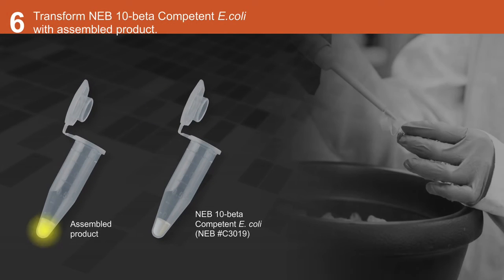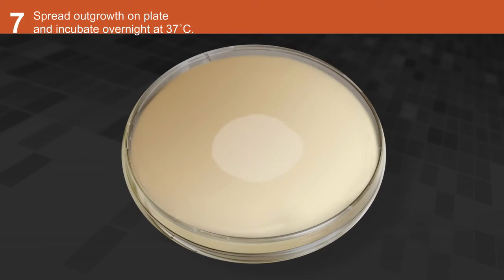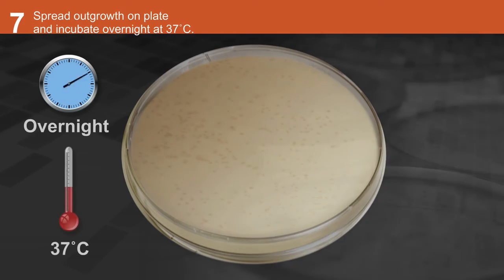Transform NEB 10-beta-competent E. coli with the assembled product. Spread outgrowth on plate with antibiotic and incubate overnight at 37 degrees Celsius.